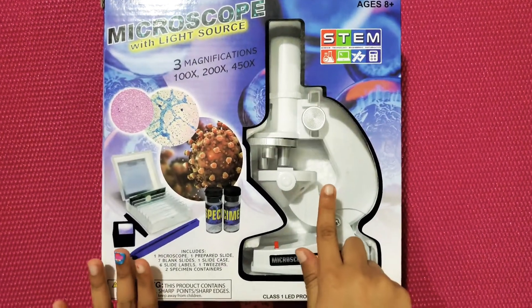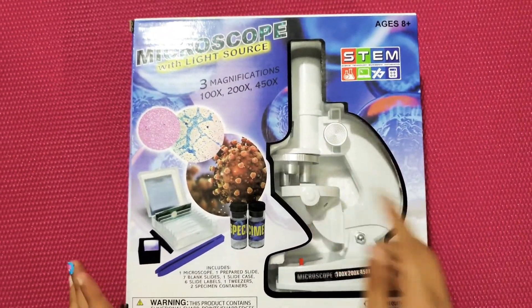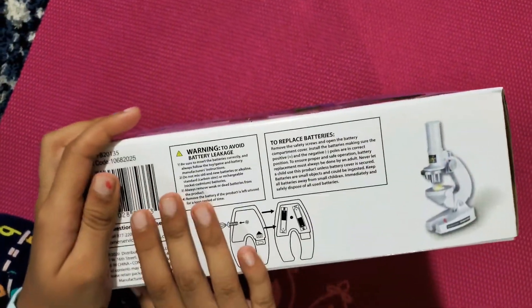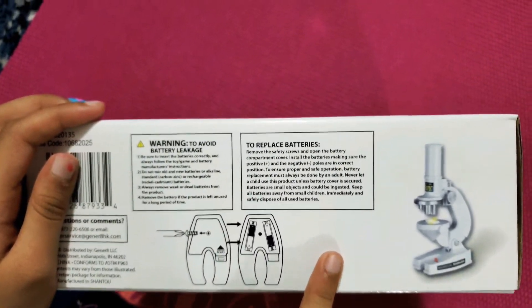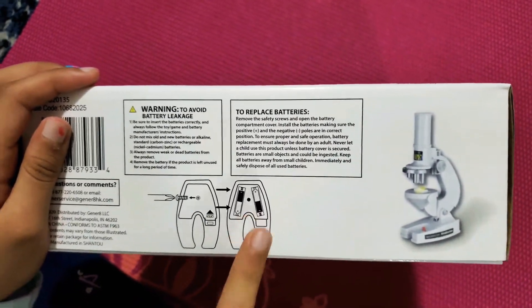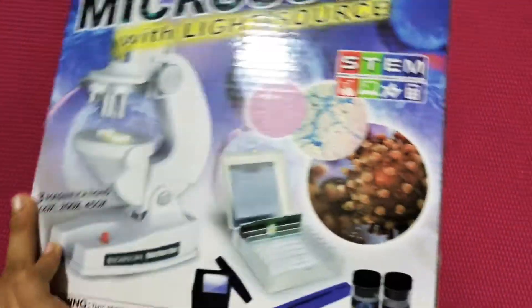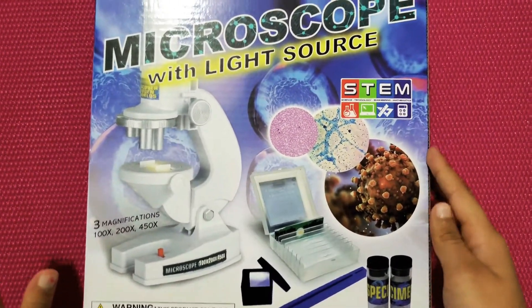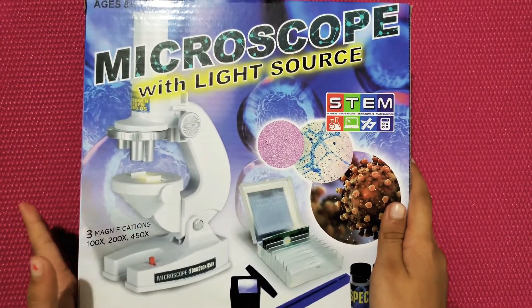So here we have the microscope. It's big, and we also forgot that there's one instruction booklet in here. There are batteries that we need to put in. The back looks pretty much the same. So let's unbox this.